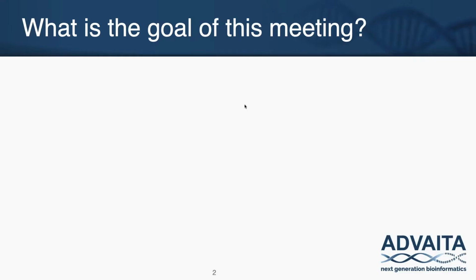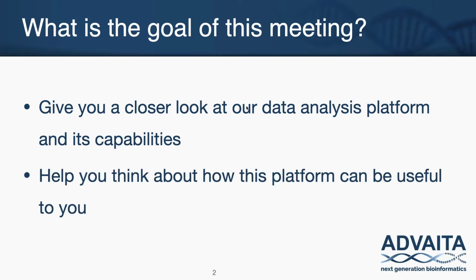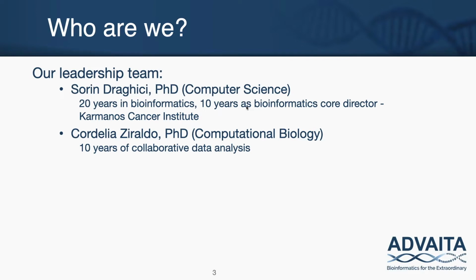The goal today is really to give you a closer look at this data analysis platform and what it can do, in order to help you think about how this platform can be useful to you as you analyze your own data. A little bit of background for those of you who didn't join us last time. I want to make sure we're all on the same page.